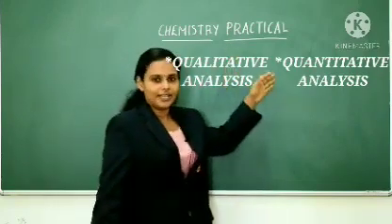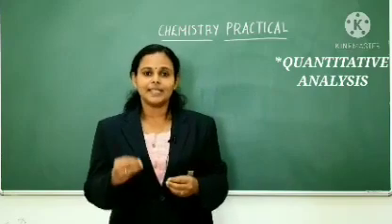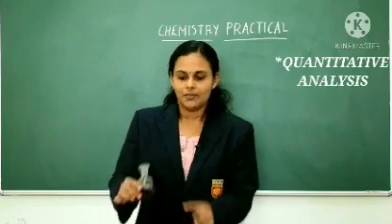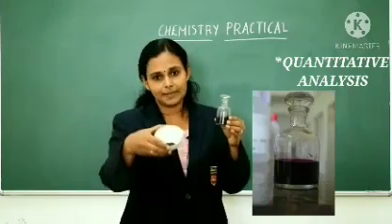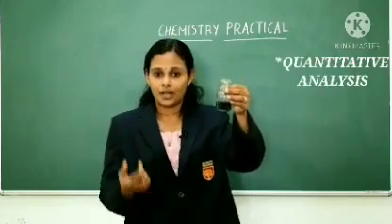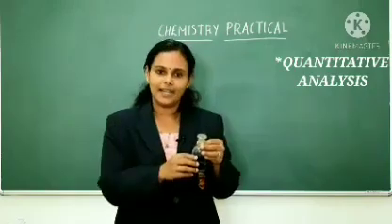Now today in this class we are going to mainly deal with quantitative analysis. Before going into what it is, let me explain what quantitative analysis is. In quantitative analysis we take a substance which we make into a solution. Suppose you have some substance and you take a small amount of it and dissolve it in water and you get the solution, and if you are asked to find out the amount of the substance present in it, we call it quantitative analysis.